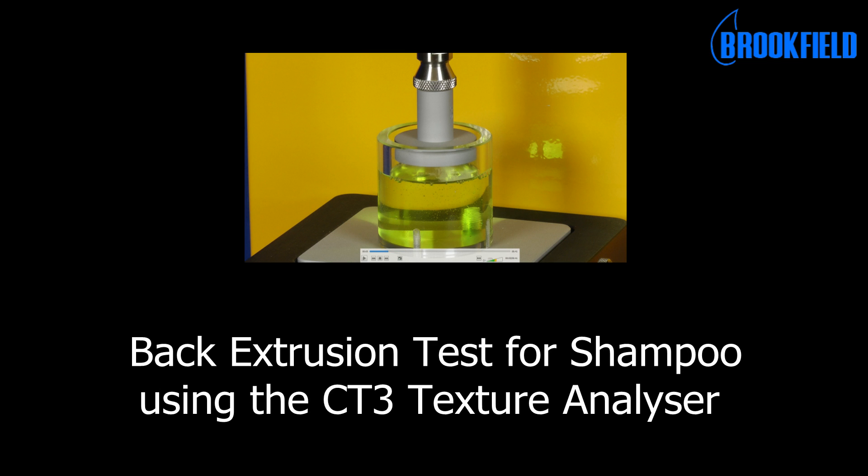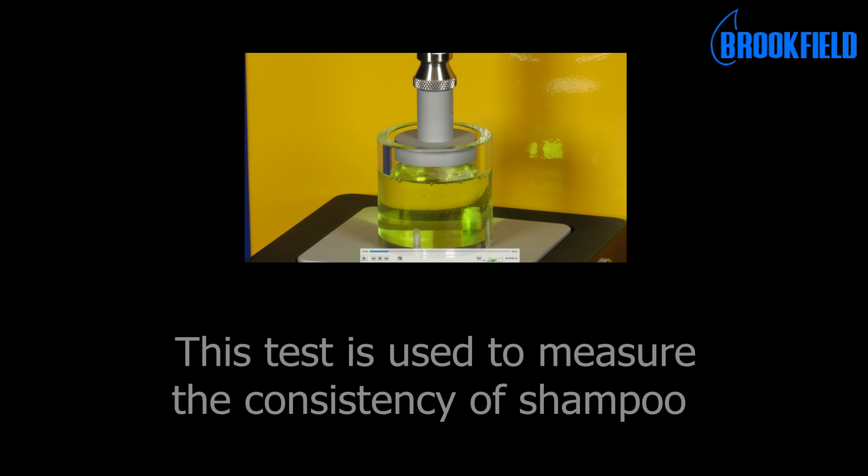This is the back extrusion test for shampoo using the CT3 Texture Analyzer. This test is used to measure the consistency of shampoo.